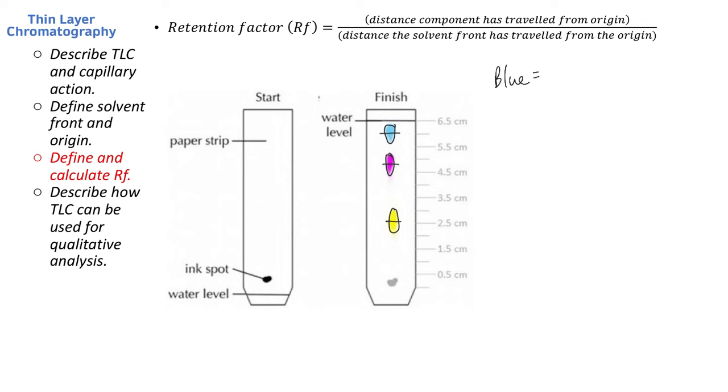So the blue one is approximately what? That's 6 centimeters, over the 6.5 centimeters of the solvent front. So the Rf of the blue is equal to 6 over 6.5, which is 0.92.